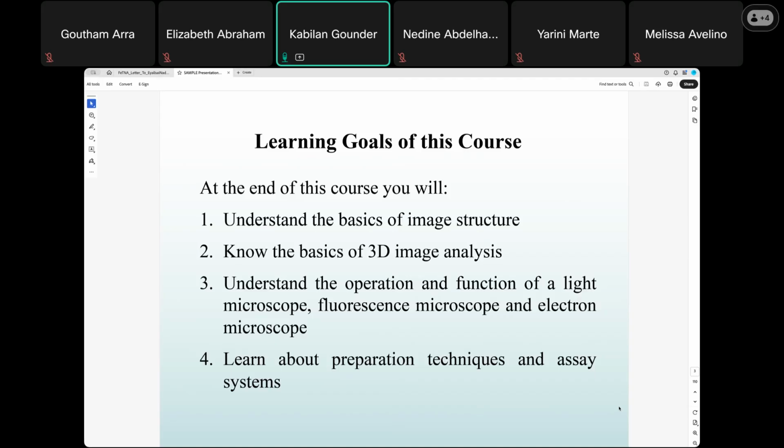How do you know that this image was taken from that particular microscope? You need to know all these details. You have to study all the methods and observe the samples from different microscopes. Then you will be familiar with what kind of images you get from these different microscopes, and that will give you important information.